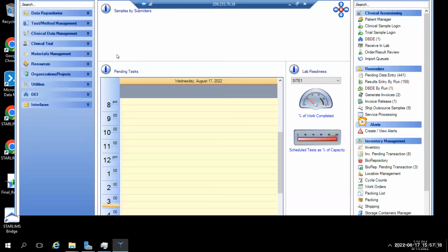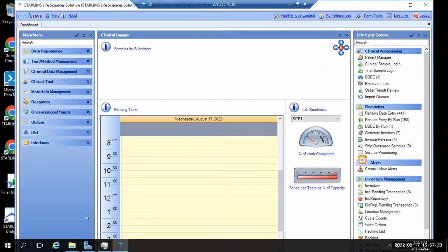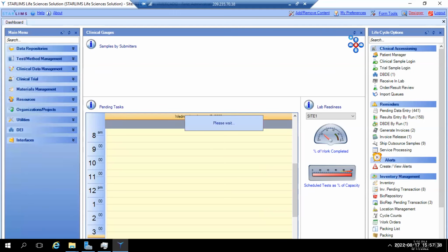Thank you. So you don't even see the designer. Let me take control. I think Jose can help you here. We did this together. Oh, there we go. Yep. Cool. And then maximize it and then go to designer.